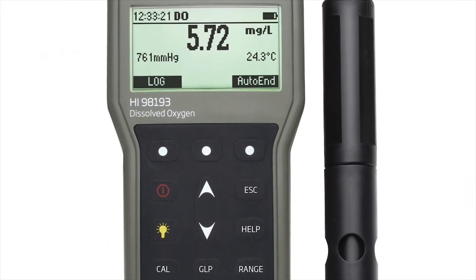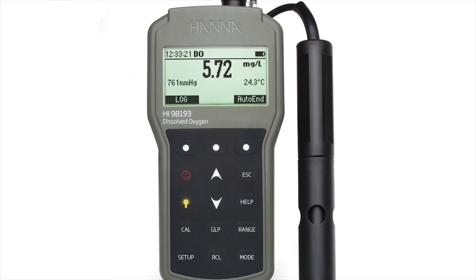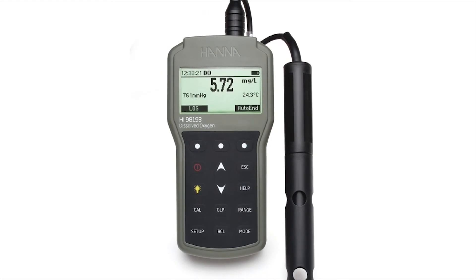The HI-98193 can store up to 400 measurement readings. The HI-98193 is an excellent choice for the customer who is looking for a rugged, waterproof meter that encompasses the features of benchtop instrumentation with the convenience of a portable meter.